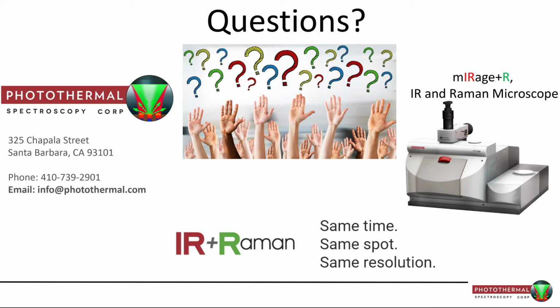Indeed, we used 2-micron thin sections because we wanted to couple, as I said, to synchrotron FTIR, in transmission. We use transmission in synchrotron FTIR because this is the mode where we can obtain higher signal-to-noise ratio. But this was not a requirement for O-PTIR measurements. Indeed, we have done more experiments in other types of cultural heritage objects, including small pieces of degraded glass or degraded metal, and there was no need for such a thin section. We just apply it on the top of the surface of this tiny object, and we got very good results as well.